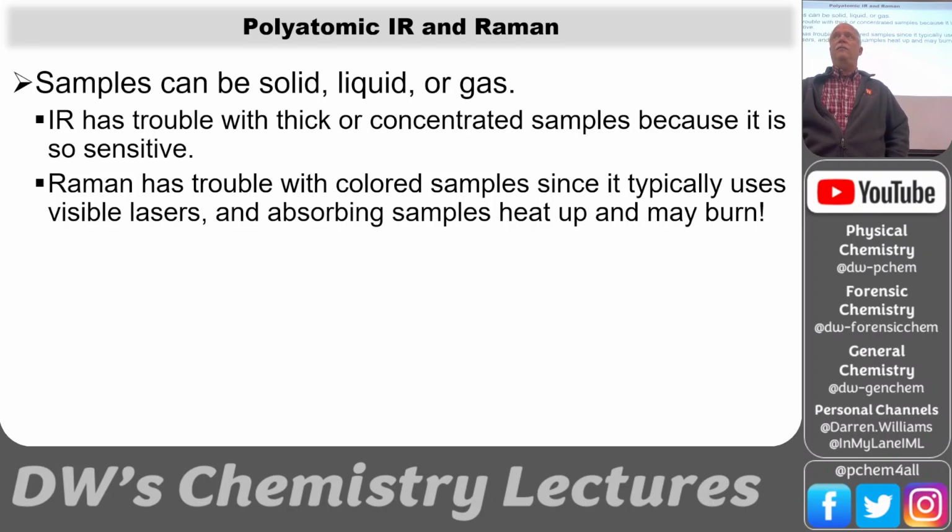I worked at my last job in an explosives factory. Okay, and so I was testing Raman to see if it would be useful for getting vibrational spectroscopy of explosives. And I started with tiny little samples. So I had like one little speck of explosive, and I got the laser on there and I saw smoke, and that was a bad thing. If you had taken a big explosive sample, like a gram or something, and stuck that laser on it, I would have blown my hands off. So start small.